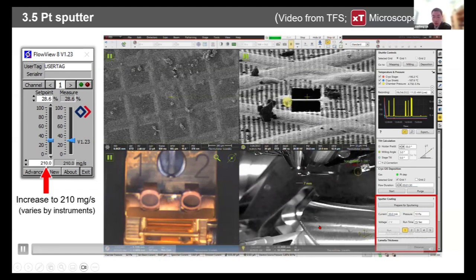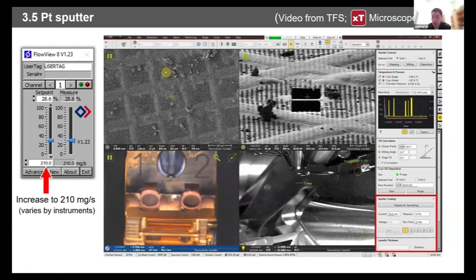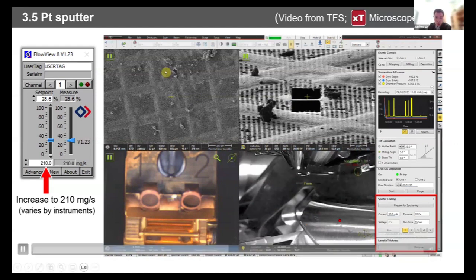The sputtering will do several cycles, and you will wait until it's finished. When it's done, the tube will be retracted, and the sample stage will move back to the location where you want to do the next step. And the shutter will also be retracted.